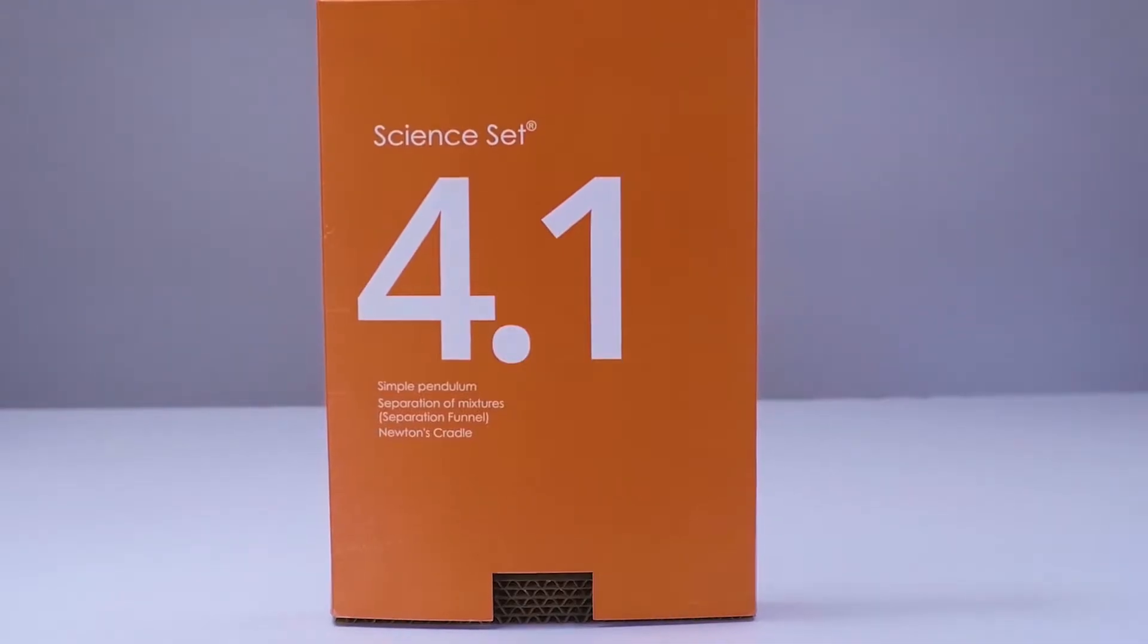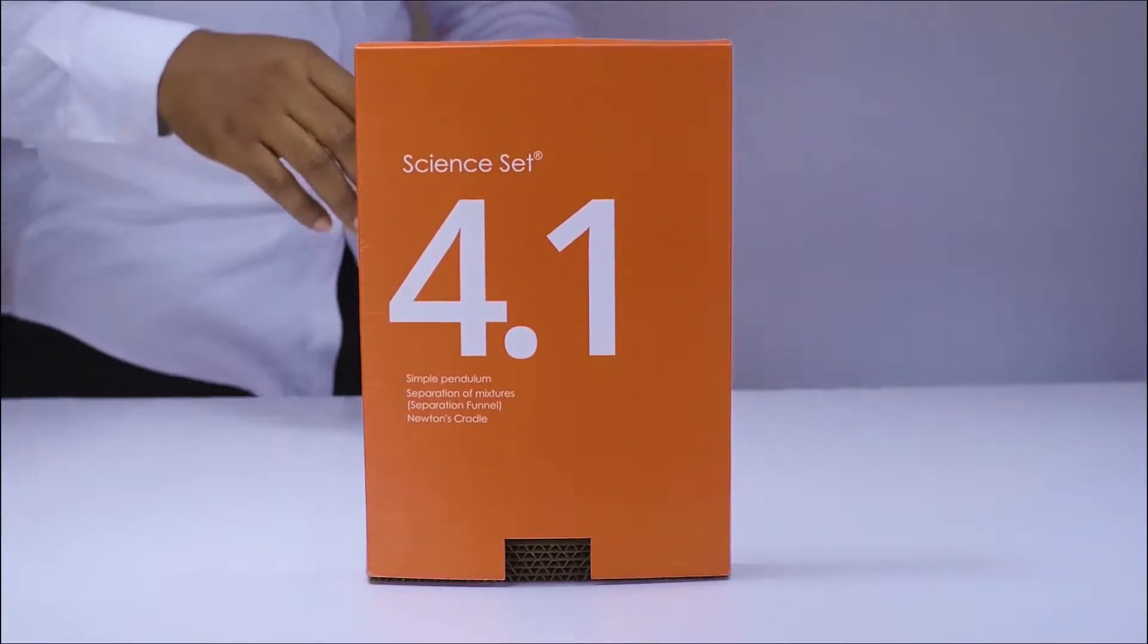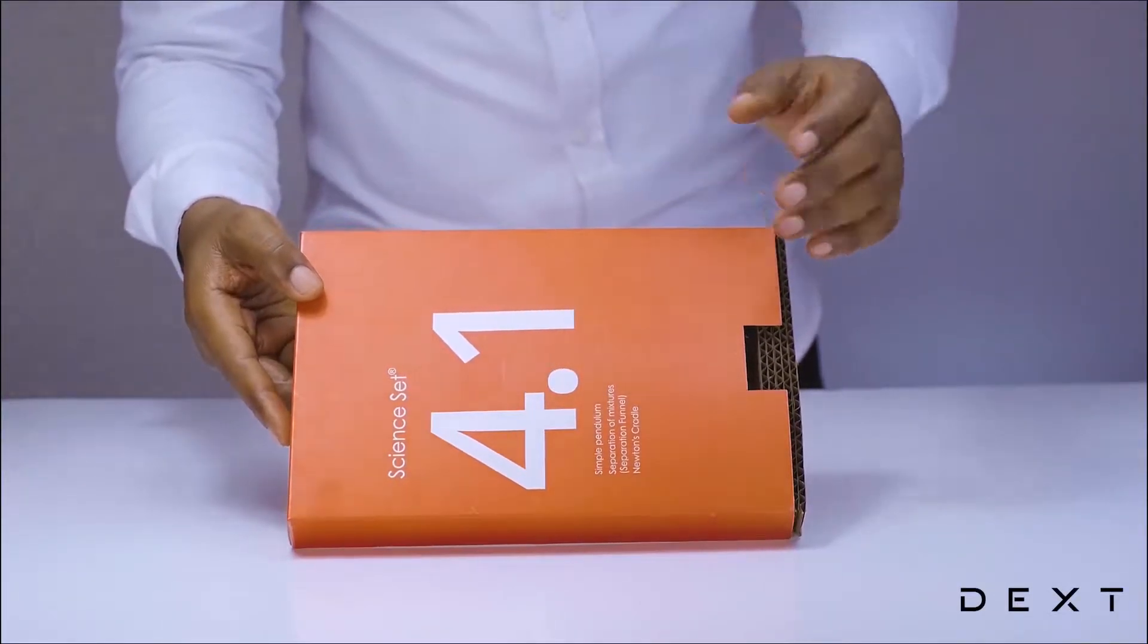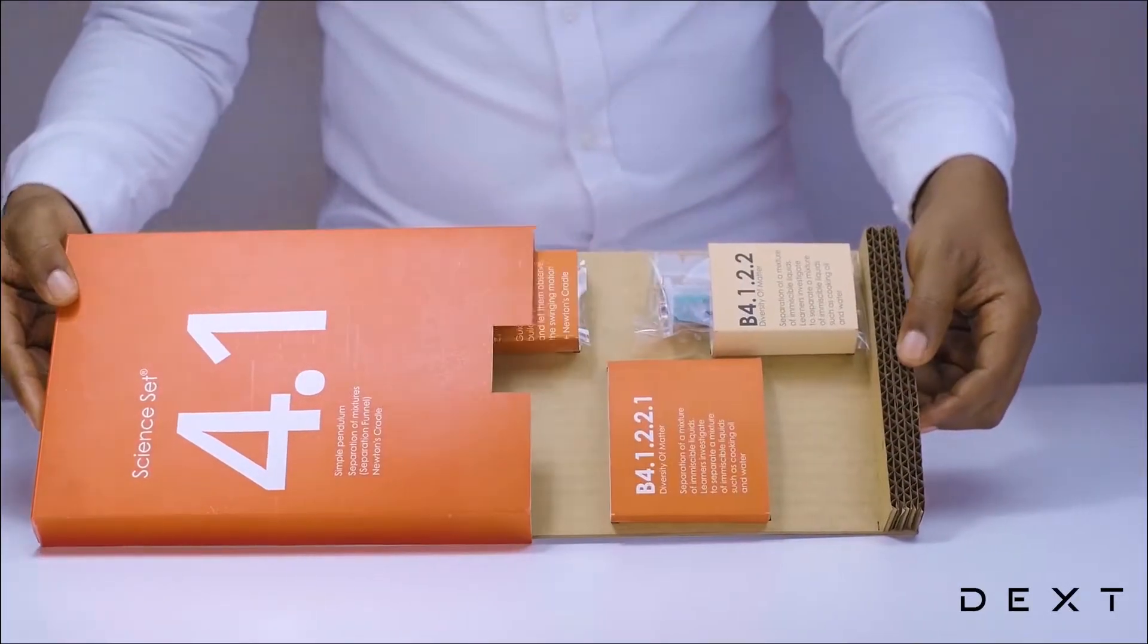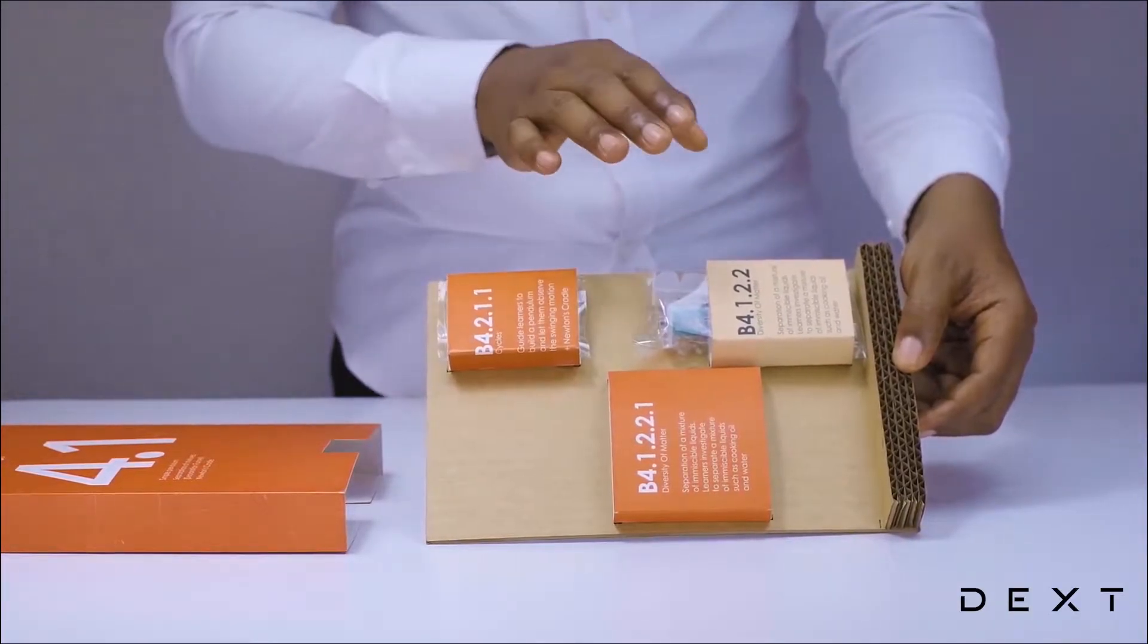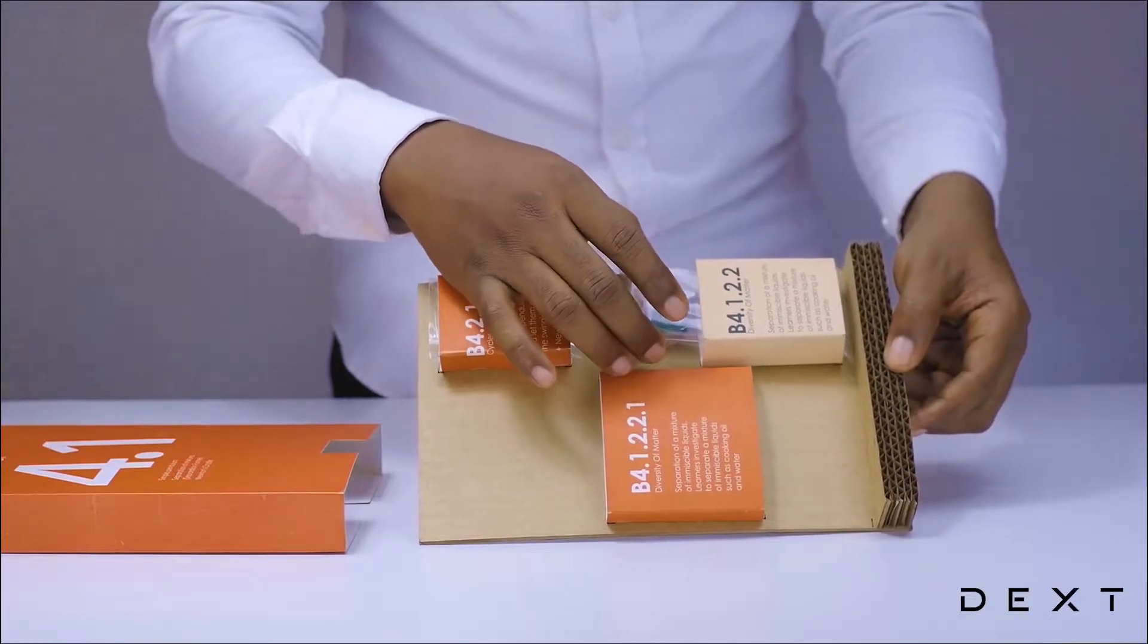This is a tutorial for Dext Science Set 4.1. Hi, in this video, we will investigate how to separate a mixture of immiscible liquids such as cooking oil and water using an improvised separating funnel, the compartment B4.1.2.2.